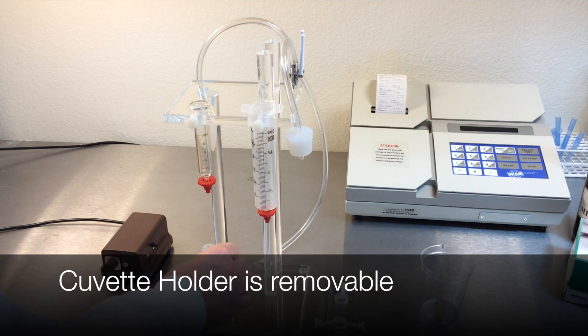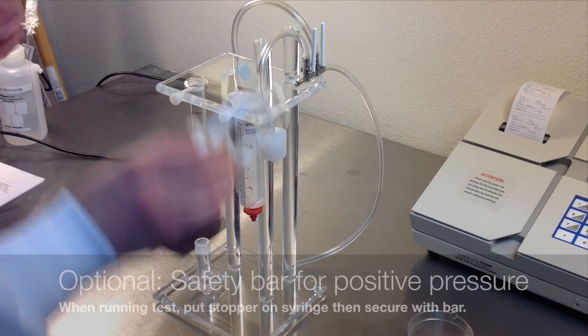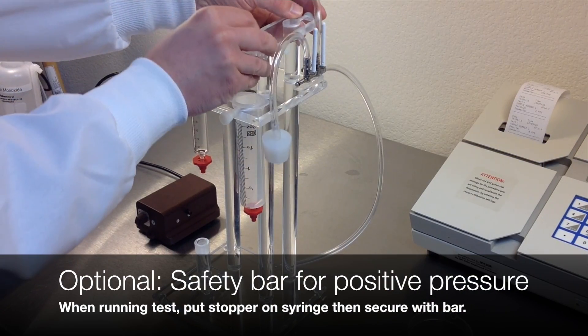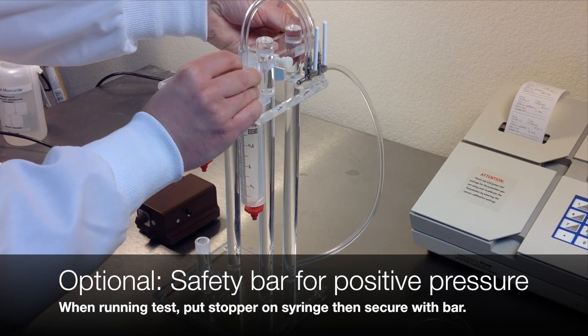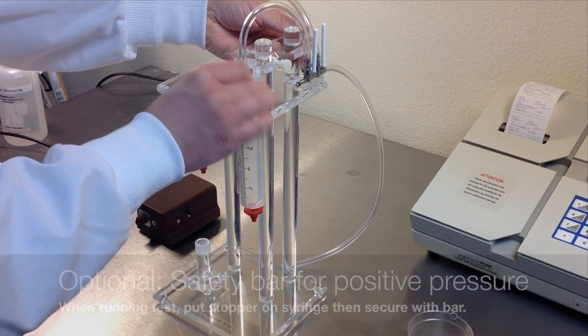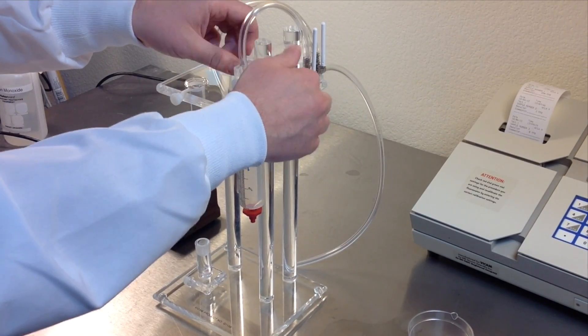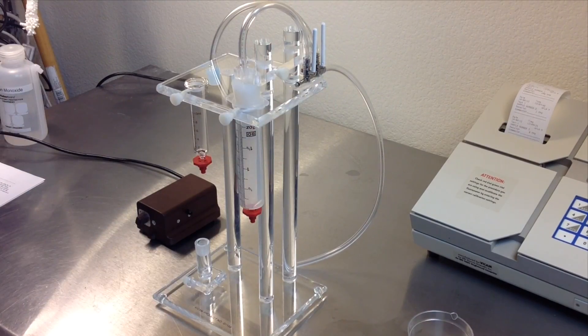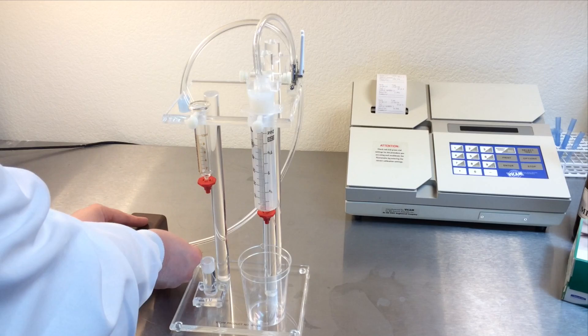The cuvette holder is removable for the last step of the test. Later in the test, you'll use the safety bar that tightens above the plastic syringe stopper and is tightened with three thumb screws. Finally, attach the pump to the hose. The pump pressure is adjustable both on the pump and using the valves atop the pump stand.